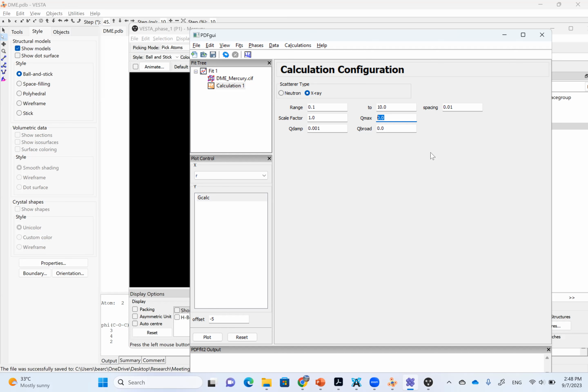But when we're talking about amorphous components, you're talking about something made of carbon, oxygen, fluorine, even hydrogen. Those are really very weak scattering components. And usually we have to be very careful when we do the masking. If you already have enough experience with PDF, you probably always mask the outermost frames for the PDF data. If it is a weak scattering sample, I think there's no doubt the outermost frames cannot be used.